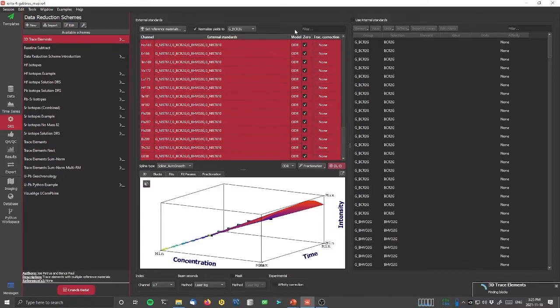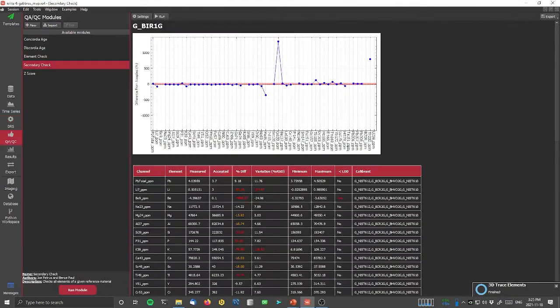And as I mentioned, this fit through 0 is really helpful where your reference materials are either very noisy or they're all clustered a long way away from 0. This just sometimes gives it a tie point somewhere down the bottom of the calibration curve. So again, it will run through and calculate the baseline subtracted channels and the blocks and the calibration surfaces, and then it'll store them for each channel. And now we have some results.